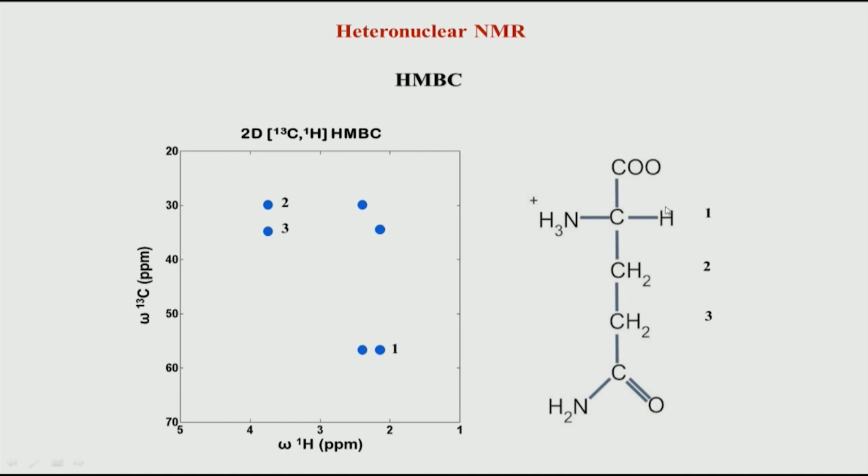What we can do, as we saw in the previous slides, is tune, meaning adjust, the delay value in the INEPT part of the HSQC such that I get only the longer range coupling values, but I can suppress the intermediate, the direct strong coupling.